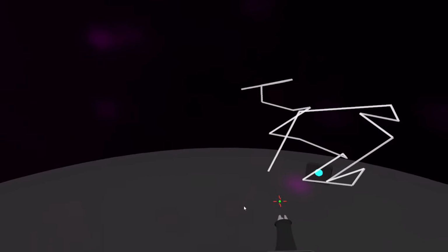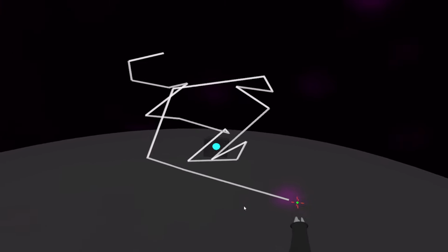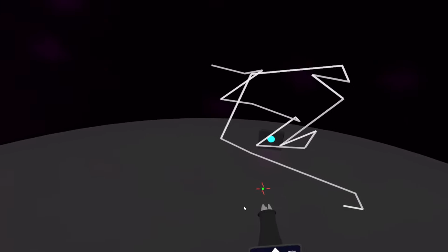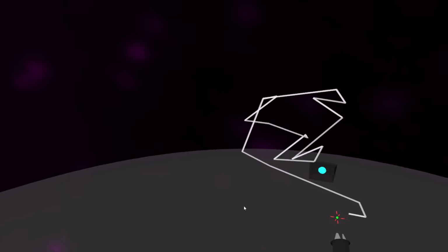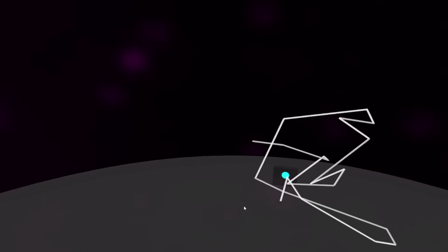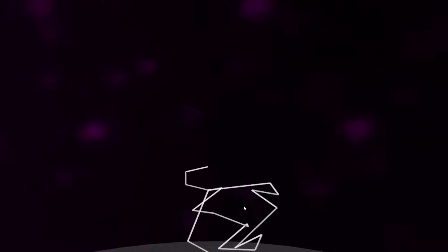And your eyes just track those cells in 3 dimensions in a very trivial manner. Like your eyes just know where did that cell go, right? It went here, it went here, it went here, right? And so you can just keep tracking.